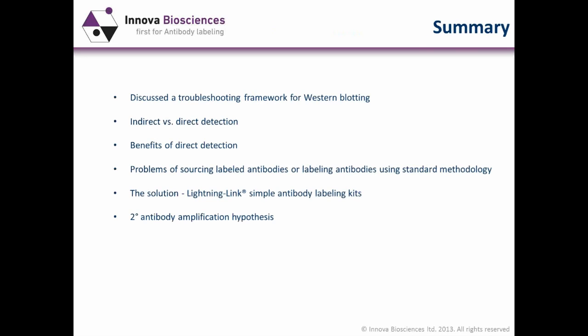And in summary, I just wanted to discuss what we've talked about in the webinar. I hope you found the troubleshooting framework useful in regards to troubleshooting your own experiments in the future. We discussed the indirect versus direct detection methods and the benefits of direct detection, the problems of sourcing labeled antibodies or labeling antibodies using standard methodology.